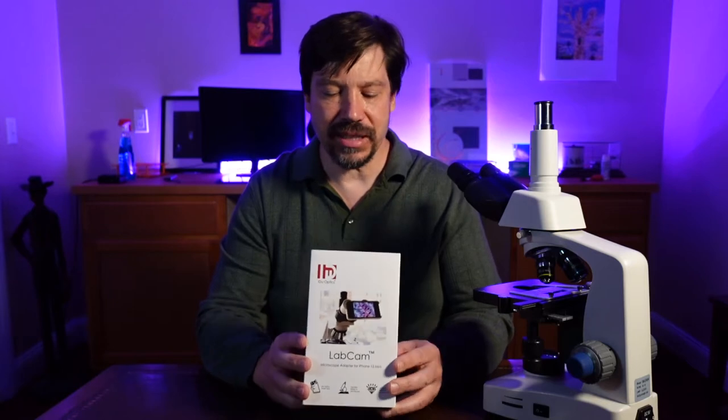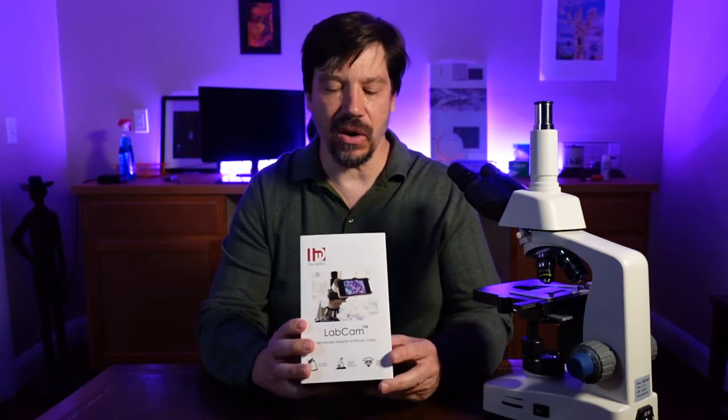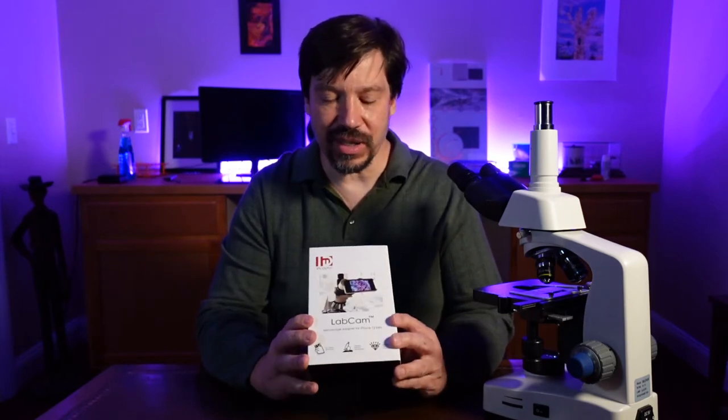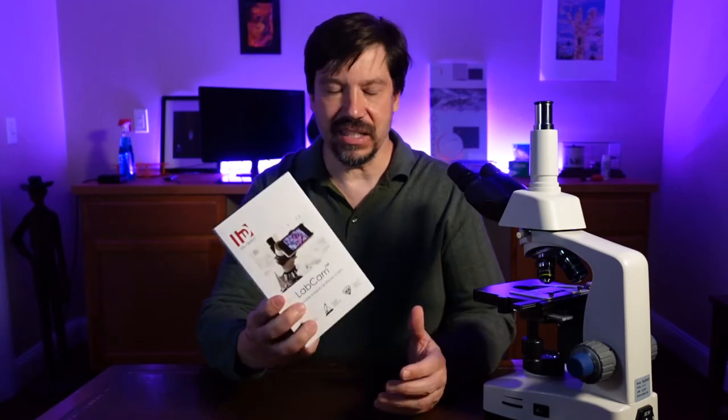I have looked at this very quickly but already I'm really impressed. The images are incredibly clear — they compete with my Nikon Z6 — and it's incredibly easy to use. So I think this really is the device that will allow us the highest quality images for the least effort. This is an absolute plug and play operation and you'll get great video and images.